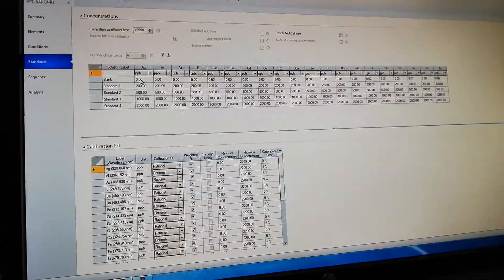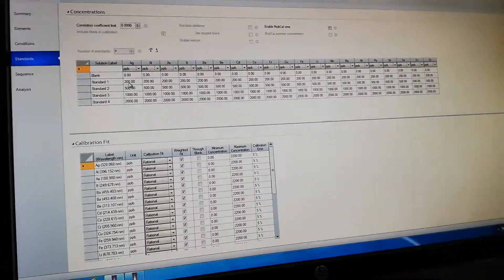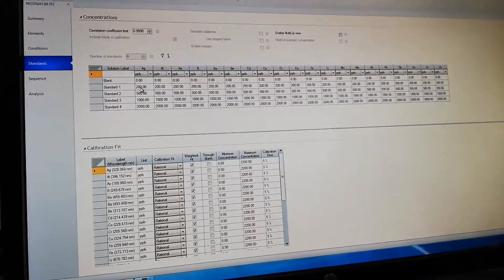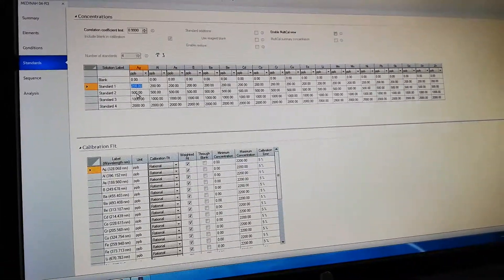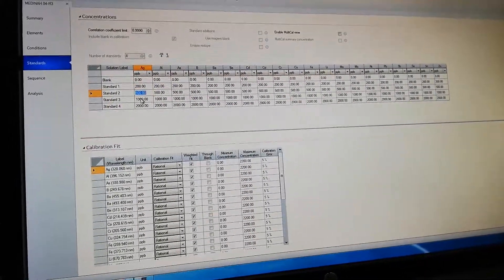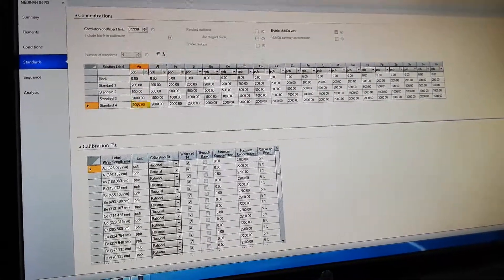These are the standards. You can run multiple standards for calibration: 200 ppm, 500 ppm, 1000, 2000.